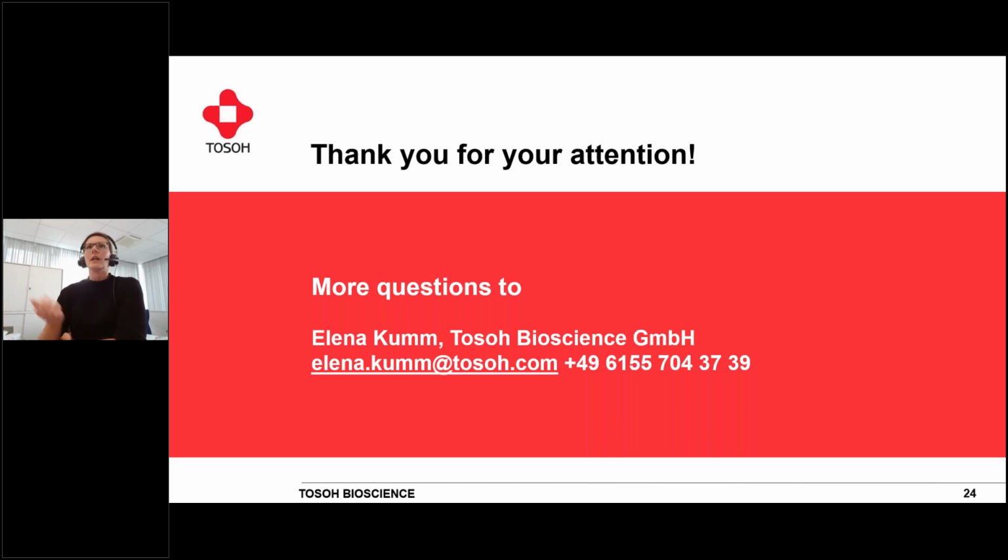And then use standard buffers. What I always did was look at the recommendation for the columns I might use, for some cation exchangers or anion exchangers. You can make a guess whether the buffer and salt they use might be suitable for your sample and just start with that. Maybe somebody else already analyzed a sample comparable to yours, or there's an old paper saying something. It's hard. Contact us or somebody else who might have an idea so we can help you.